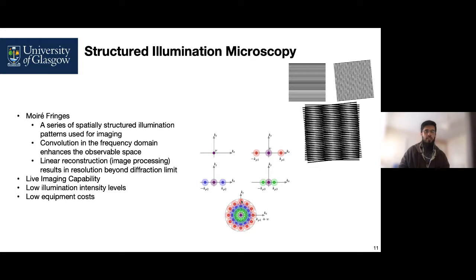With post-processing techniques, where initially we would have been able to find only this much frequency content for a sample, now we are able to find an enhanced frequency content. This translates to much more sharpness as well as higher resolution for microscopic techniques.